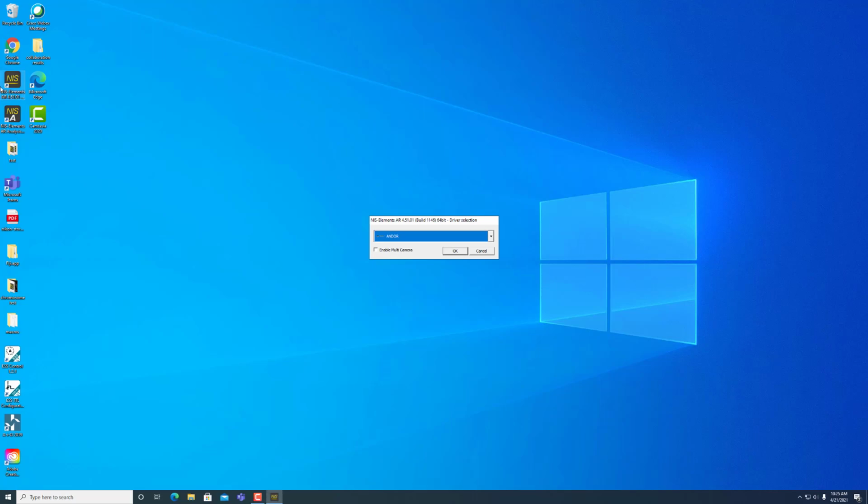I have booted up the instrument. There's a video for that as well. You can check that out. And all I've done is double-click on this NIS Elements icon, and I typed in my user profile. But this is the next window that pops up after you've typed in or selected your user profile. And you can see that there's actually a host of different options here. There's 2 Andor options and 2 Hamamatsu. Andor just refers to one of the cameras, same with Hamamatsu.